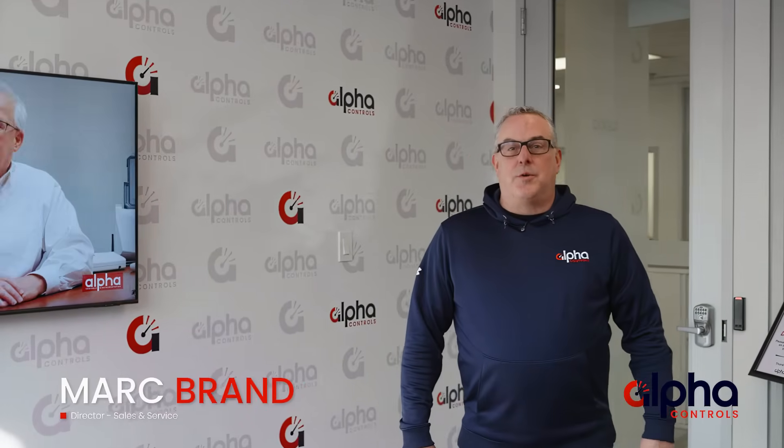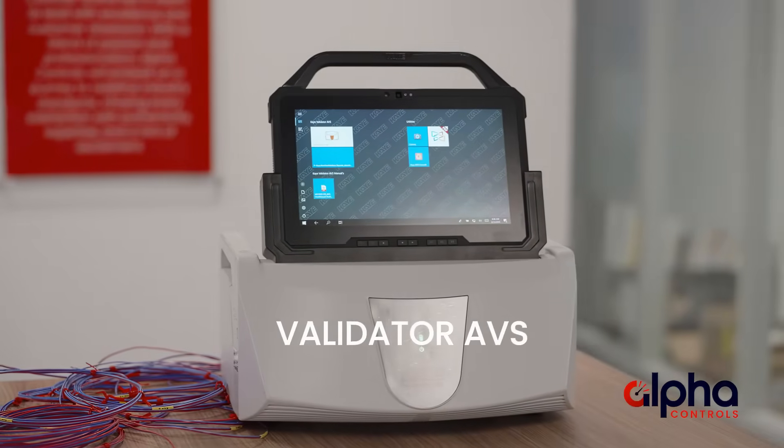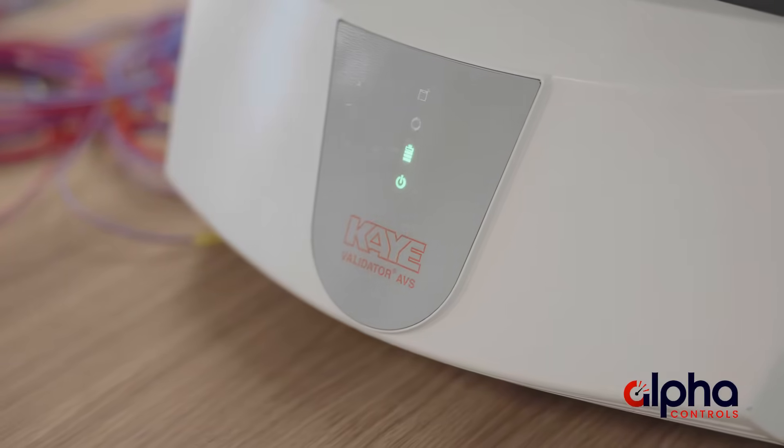Hello and welcome to another episode of Brands Brands. I'm Mark Brand from Alpha Controls and today we're going to dive into the Validator AVS, the premier temperature validation system from our trusted partners at Kay Instruments. In this episode we're going to look at all the components that make up a validation system, how to program a study, and also how to generate all the reports required to meet all your regulatory compliance.